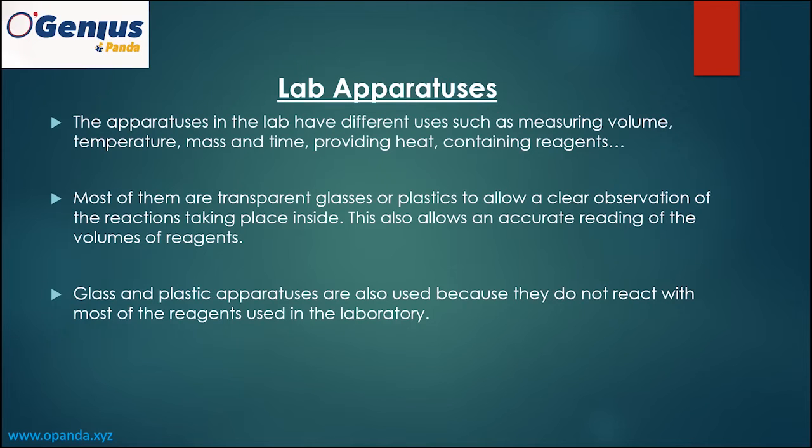Most of them are transparent glass or plastic to allow a clear observation of the reactions. If you are carrying out a reaction in a given container, it should be transparent so that you can see any changes which may take place.